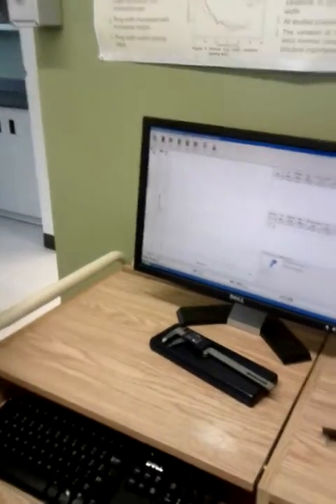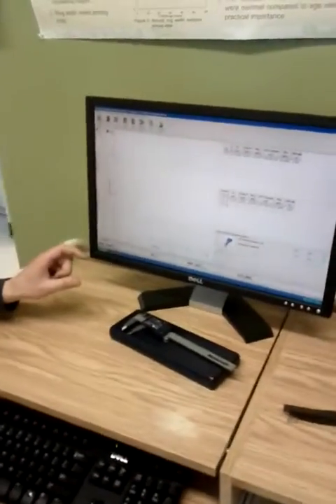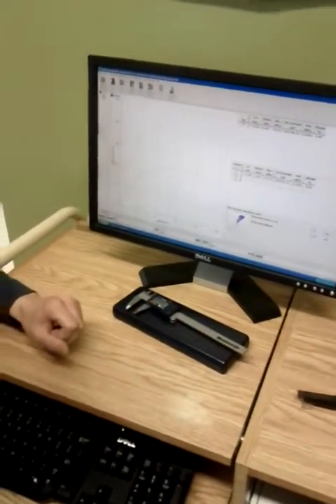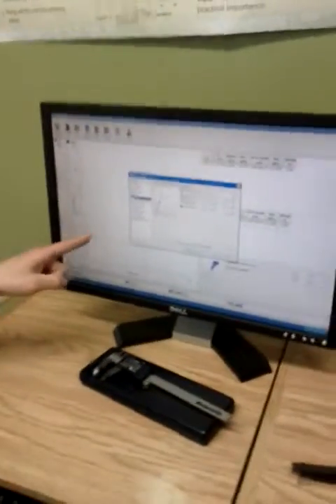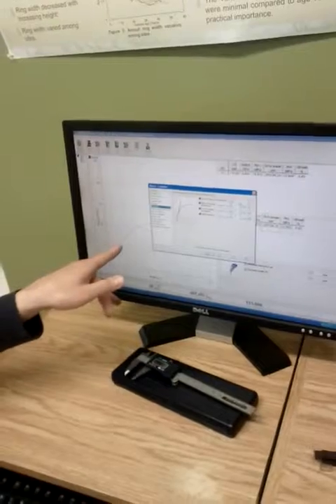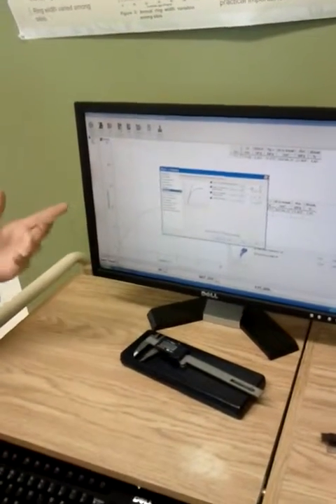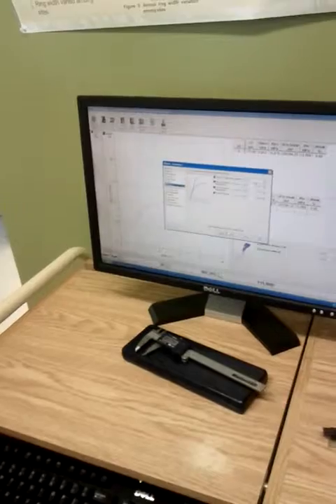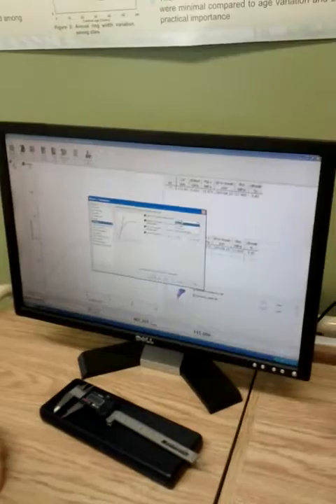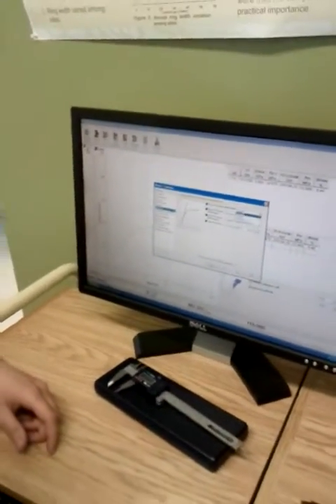So there's one last thing to do, which is to adjust the measurement of the modulus of elasticity. There are different ways of measuring the modulus, but in all cases it's the slope of the linear part. I prefer to use the secant. It means it takes 2 points and draws a line. There are tangent, secant, and regression. It's how it calculates the modulus.